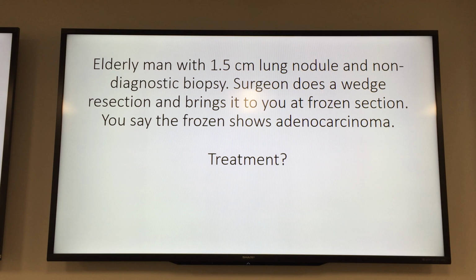Now just to complicate things a little bit, sometimes the surgeon will write on the form bronchial margin only. Then only do the bronchial margin. For some reason they don't want the others, that's fine. But typically when you get a lung lobectomy specimen, this bottle, you want bronchial margin, vascular margin, parenchymal margin. Does that answer it? Yes. Clear to everybody? Lobectomies have 3 margins. How about the pleura? Is that a margin? No. The pleura floats. There's no margin there.